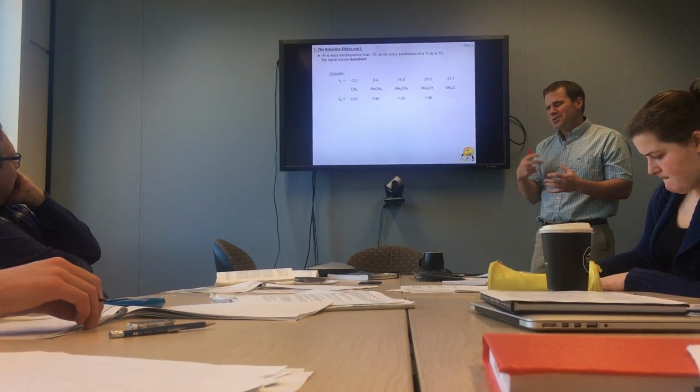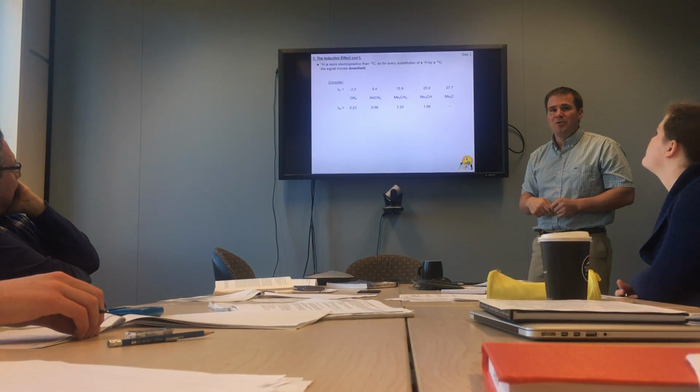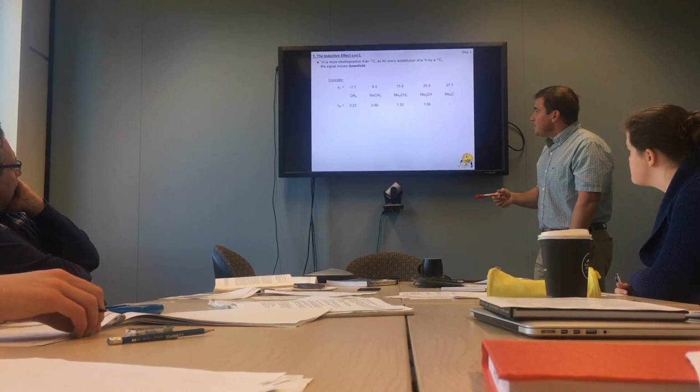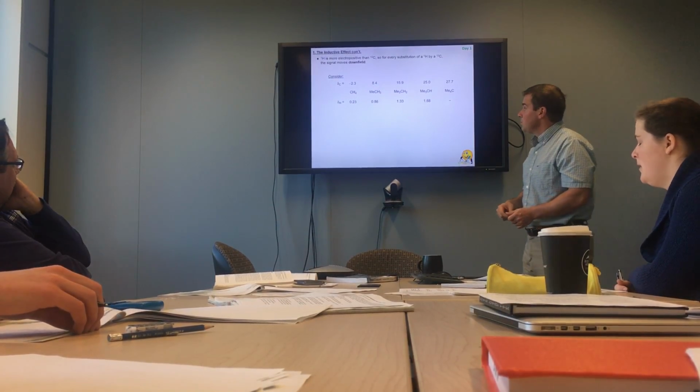And that turns out to come pretty close to the alpha value that we're going to talk about when we get to the additivity tables. That's where that comes from. In the proton channel, we're seeing the same thing, but the magnitude, of course, is smaller because the window is smaller in the proton channel.